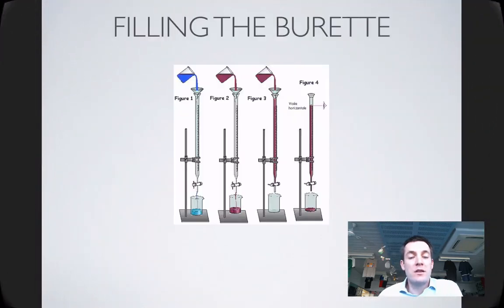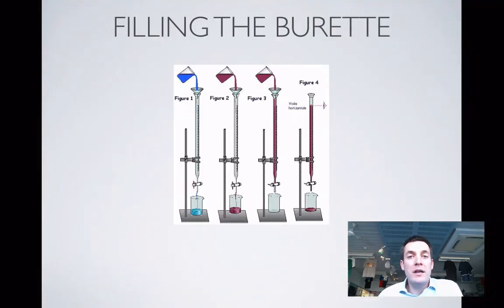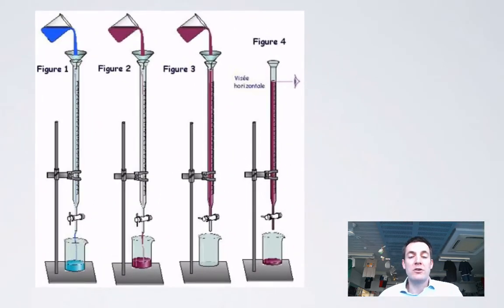As I've said, you may choose to use distilled water first of all to rinse your burette, but your rinsing before filling really ought to be done using the solution that you're filling the burette with. Make sure that when you do fill the burette, having emptied it out after rinsing it, you've filled up the jet.